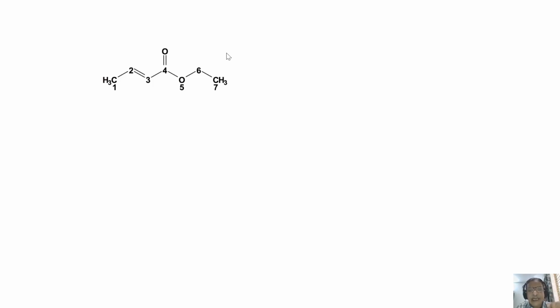You have to first look at the type of spectrum you get in the 1D NMR, and afterwards see whether you can extract the information in a straightforward manner with an easy analysis. Then you have to choose the appropriate dimension.